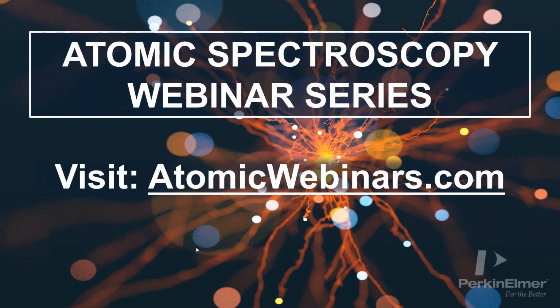And another comment here, not a question, but still, dual analyte would be useful to make the ratios of elements in the cells, if you would like to have the analyzed element and a reference one. So if possible, could be. I mean, that's a good point. Yeah, especially I could see that with single cells. You could ratio things, like intrinsic to non-intrinsic metals. Yeah, that could be, sure, right? And you can identify certain things that could be tagged things. So yeah, I think that's a good point.